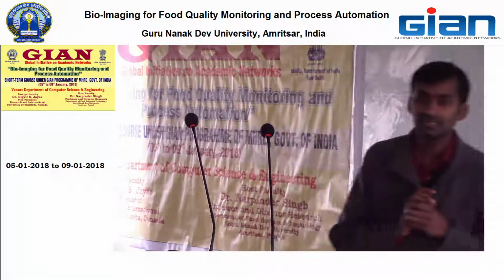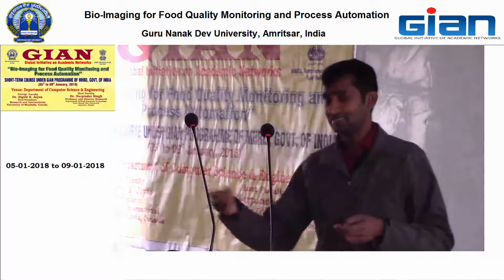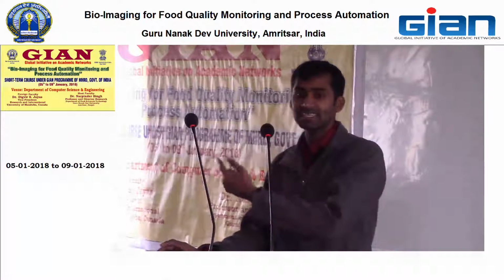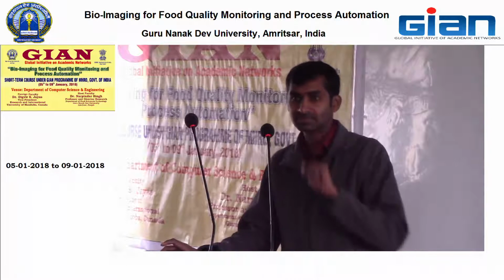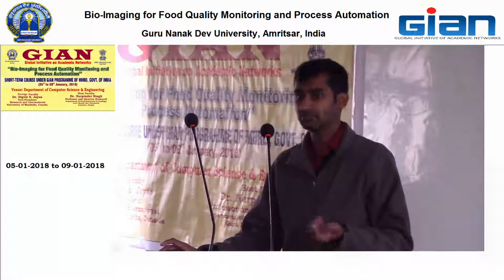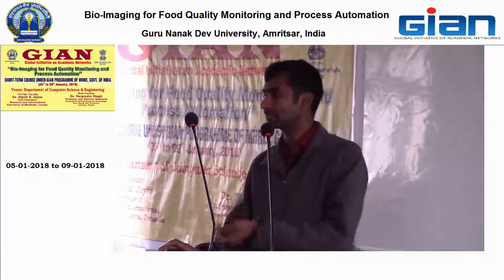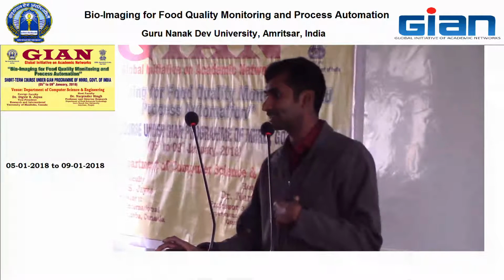Can you check it? ImageJ? ImageJ. Just take one picture, it's easy to download. Yesterday I just installed it on this PC. ImageJ. We can do it, but I'm not sure whether it's allowed to download any software here or not.